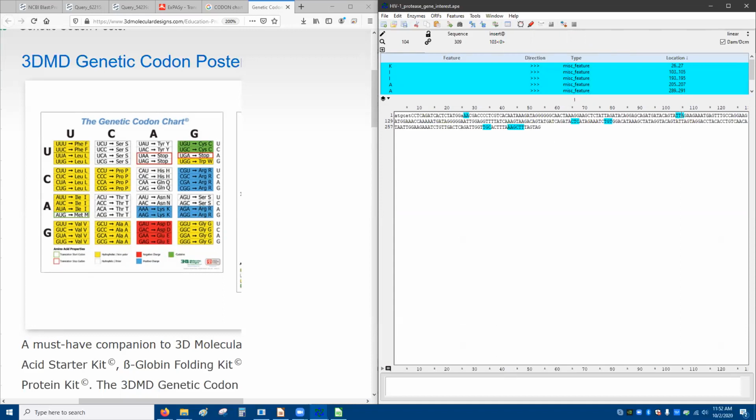Next, we have I. We want an I. I can be AT anything. So right now we have TTA, which is not the same at all. I guess we could do this. ATA. Very good. And then here we have I, CTC, which is not what we want.